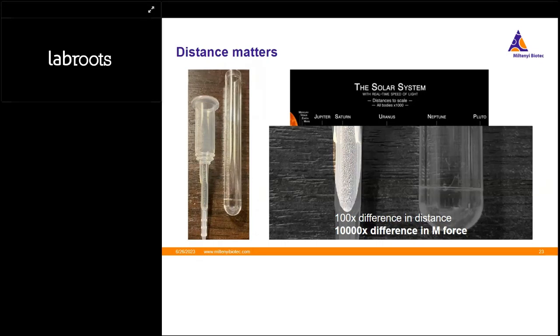And because of that, by applying the same amount of antibody and microbeads, the same concentration and all that, the selective power from a column-based system will simply be much stronger compared to a column-free system. And in order to overcome that shortage, the vendors providing the column-free system will generally require a higher concentration of antibodies, or their microbeads used to produce this selection force will generally need to be much bigger.